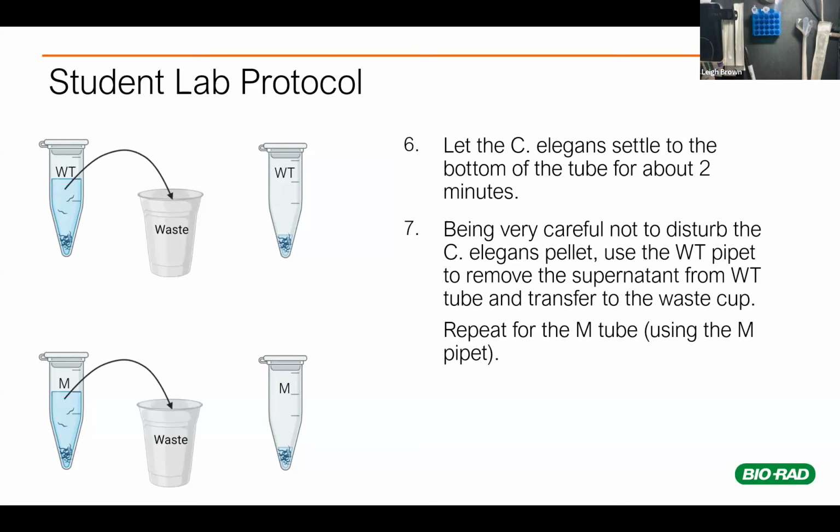Really, at the end of this, we only need 10 microliters worth of worms, and so you will probably have plenty of worms there as you finish this washing protocol that we're going to be running.